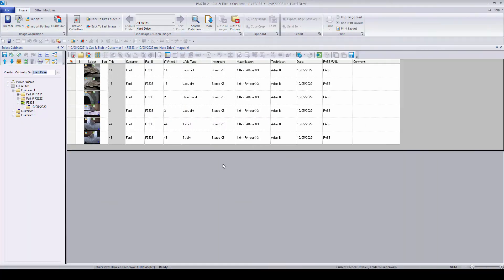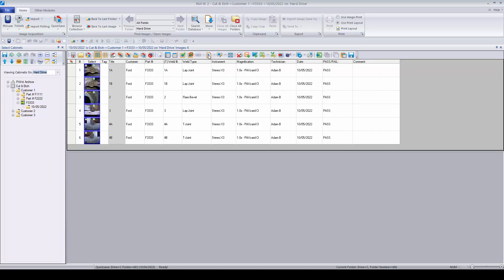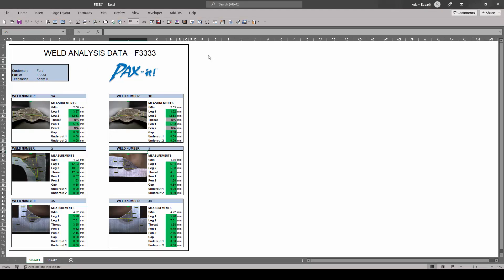Like other features shown in this video, report generation may be further automated by matching template names to the entries of a designated Paxit database field. In this example, by matching the template title to the entries in the part number field, users now simply select images, click the report button, and Paxit chooses the template. Synchronizing with the database in this fashion is a unique function of Paxit that further consolidates user workflow while reducing the chance of user error.